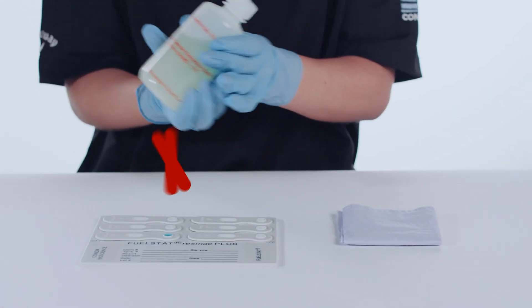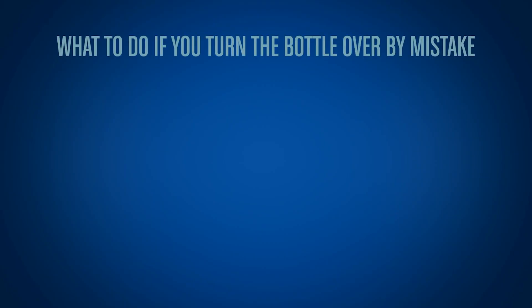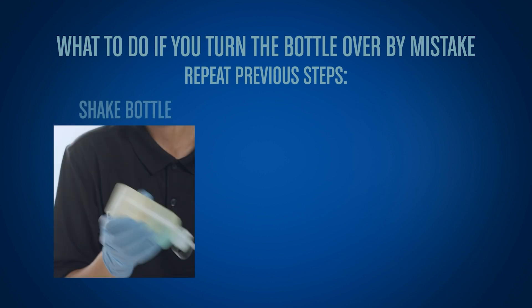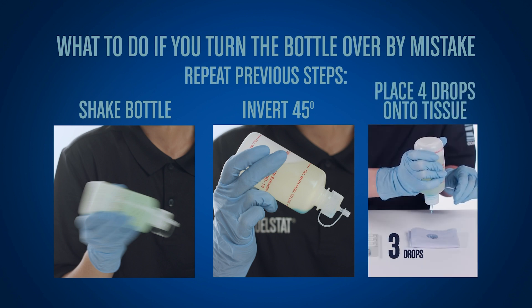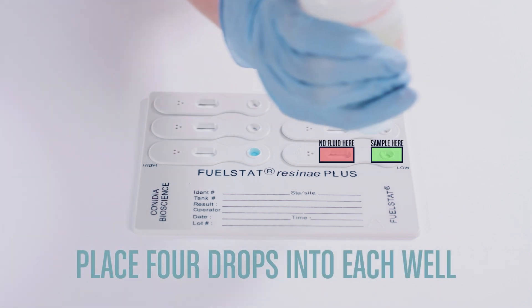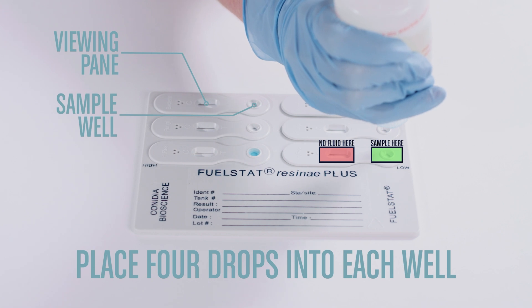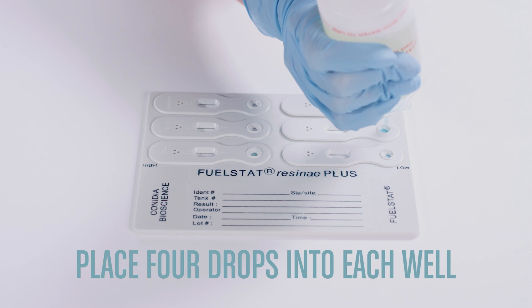Do not turn the bottle from pointing down to pointing up until the test is completed. If you do turn the bottle over by mistake, then repeat the previous steps: shake the test bottle once more, invert at 45 degrees to let the blue fluid settle again, and place 4 drops onto a tissue before continuing. Place 4 drops into each well. It is important to never let any fluid enter the viewing panes, as this may ruin the test.